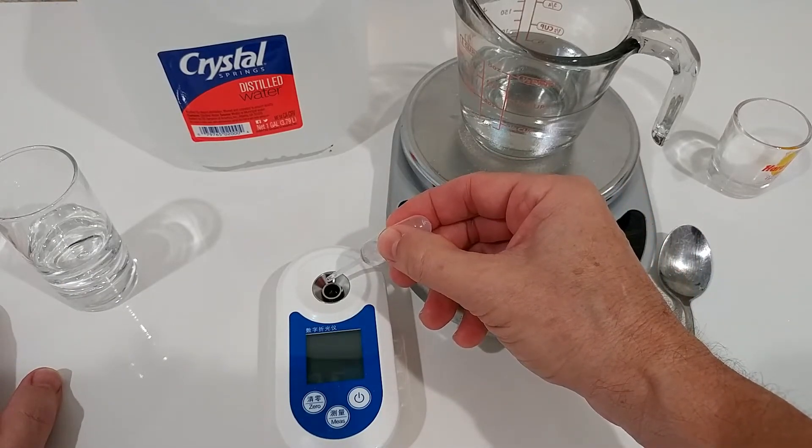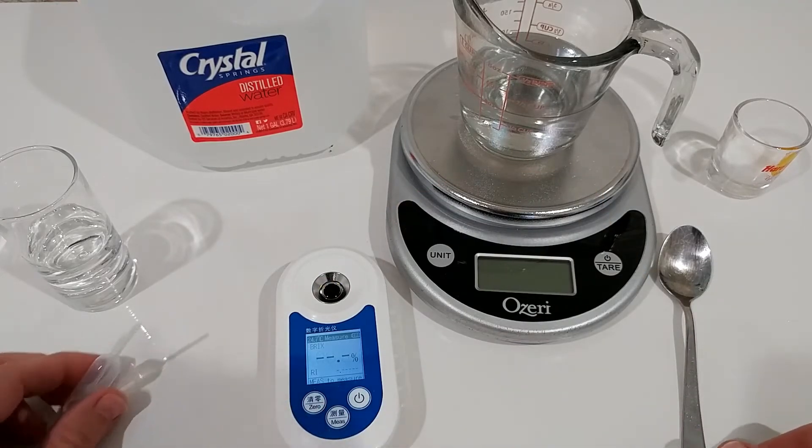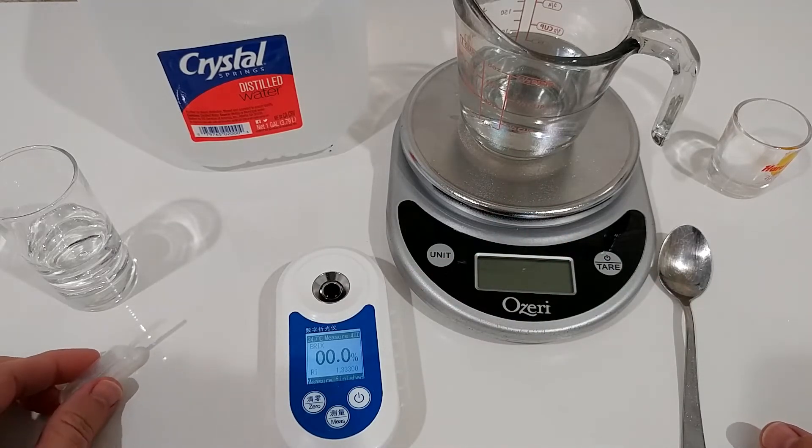I'm using distilled water here. It was turned off, so we have to turn it on. Then we do the measurement. Everything is at the right temperature and it's reading 0.0 — so perfectly calibrated.